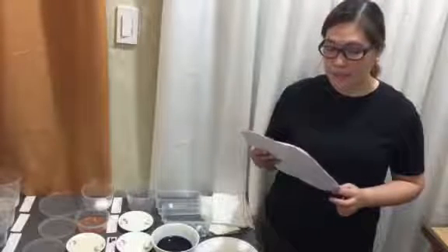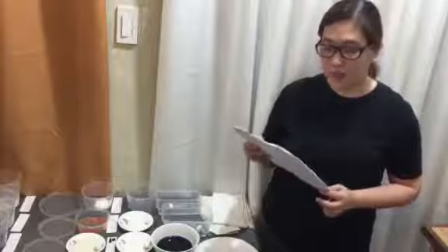The title of this activity is Acids and Bases and Solubility and Equilibria. The objective of this laboratory exercise is to be able to make a simple indicator to help identify acids and bases, classify common household items as acids and bases, perform a simple acid-base reaction, identify the chemical equation and predict the product based on the reaction.